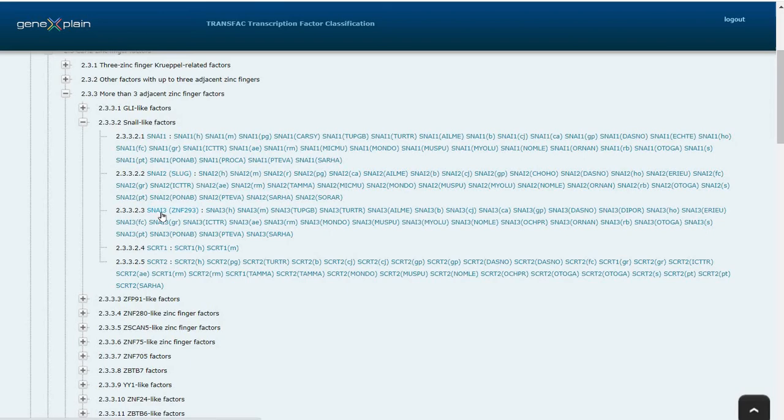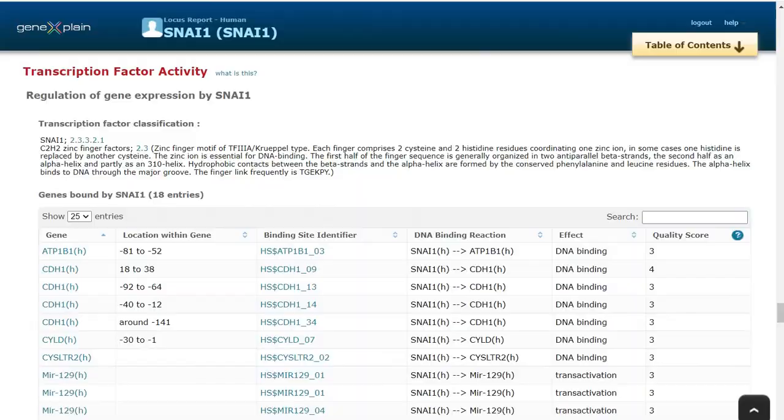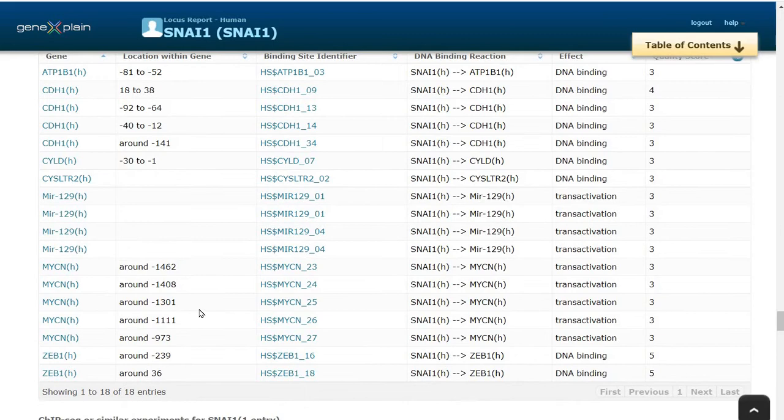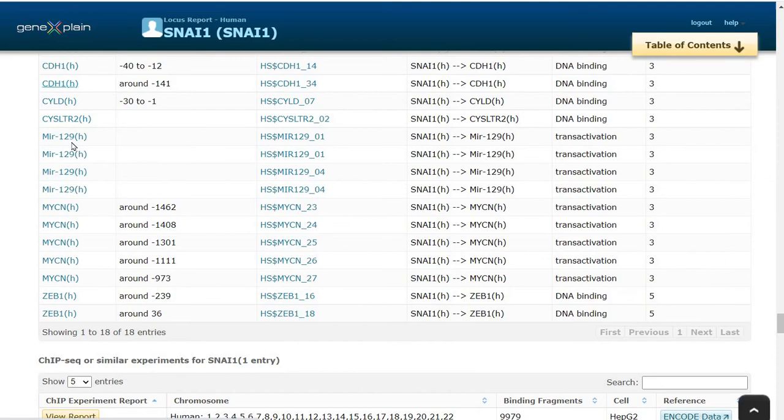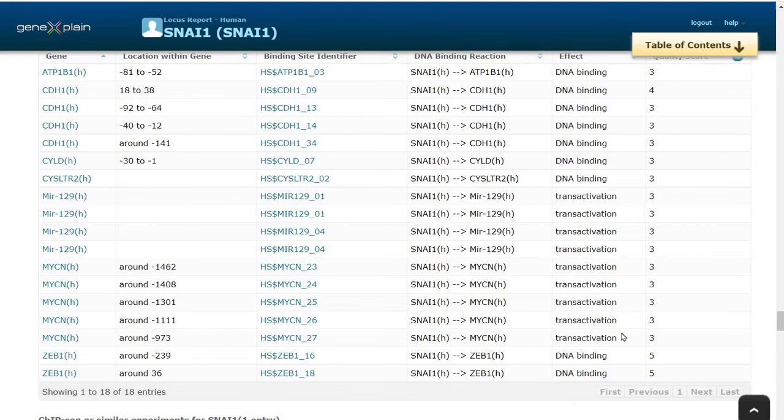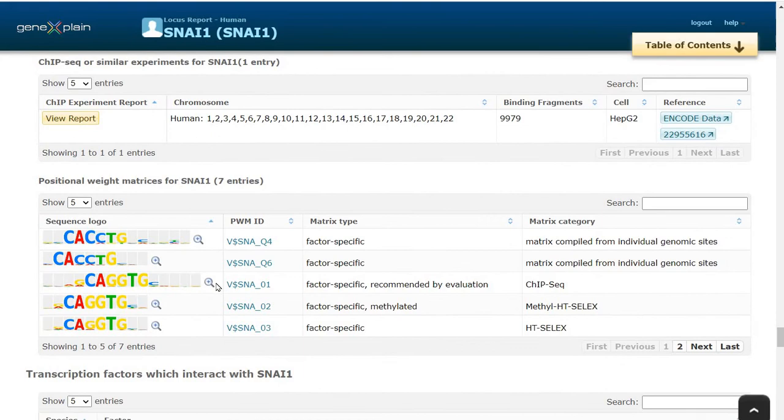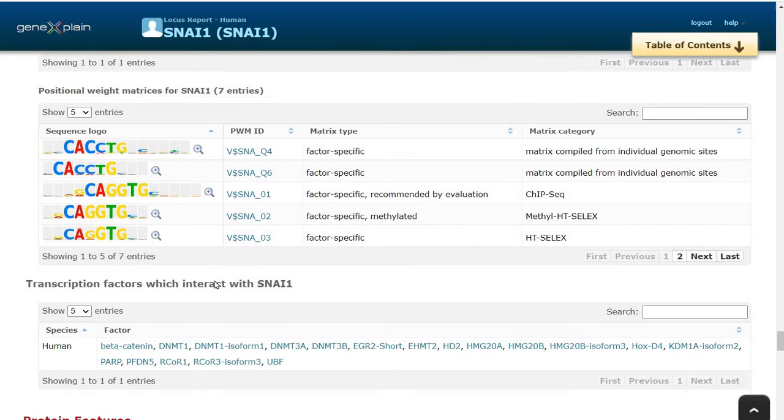There are related factors like SNAI2, SNAI3 which are in subfamilies. We can also see the known binding sites for SNAI1 transcription factor, experimentally proven and located in the promoter of different genes. We see here several SNAI1 transcription factor binding sites in the promoters for MYCN, CDH1, and ZEB. We can also see the effect of SNAI1 binding in these genes, whether it is transactivation or it is a DNA binding.